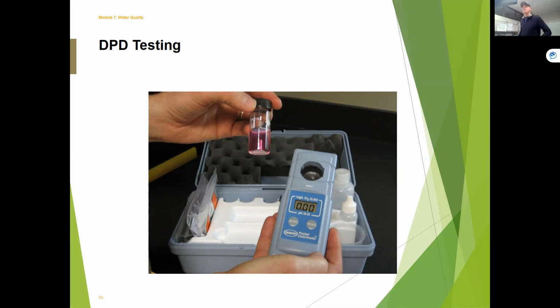Unfortunately, sometimes it's hard, right? Because we are out in the field with these units and it's raining or snowing in our case, it's cold, or hot. But I can't stress enough how important it is to keep your vials clean. Because if the vials aren't clean, it will cause you a whole lot of issues downstream.